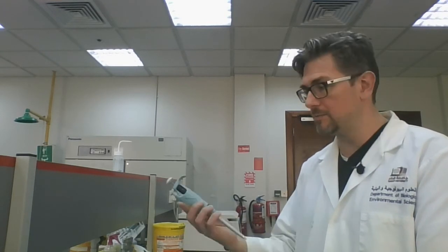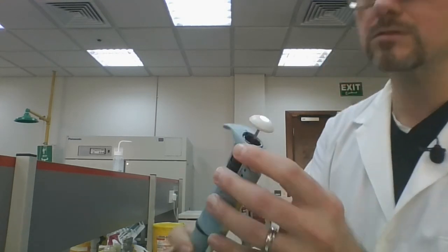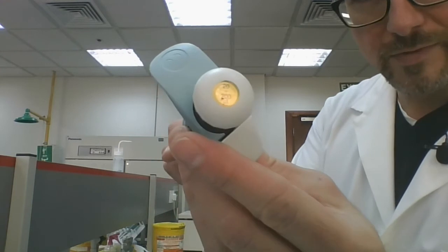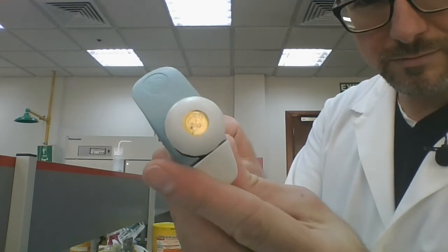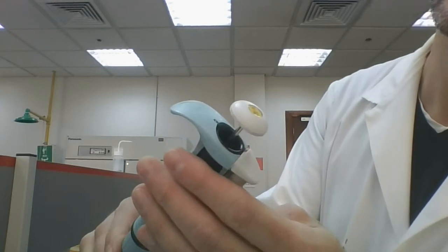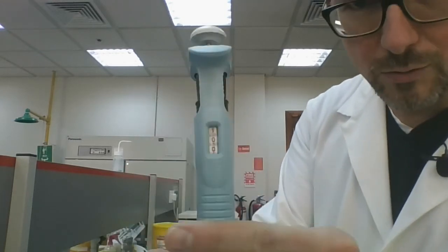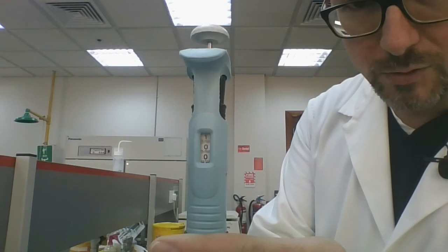Our centrifuge is almost done, so we have a few seconds left on this timer. While I was waiting for it, I prepared a micropipetter for myself. I have a P200, and it is set to 100 microliters.